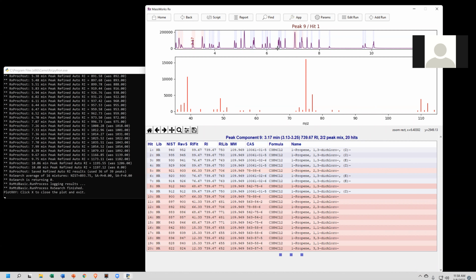And kind of running out of time. I'm sorry, I went over a little bit. I hope this gives you a feeling. I didn't talk about quantitation.